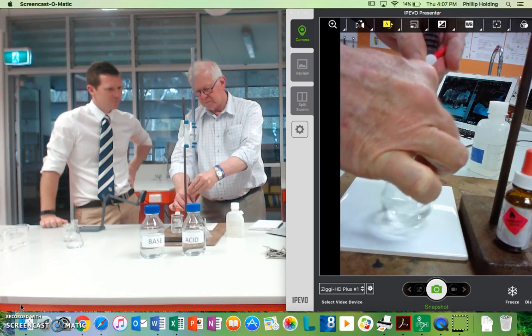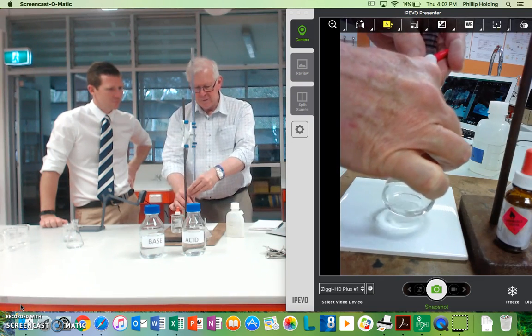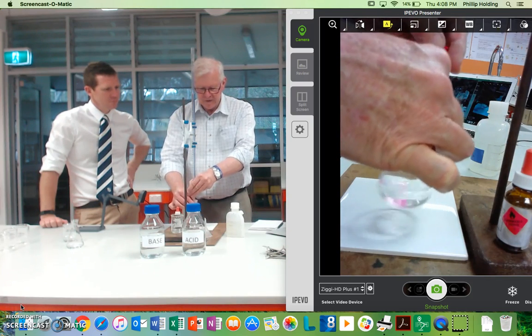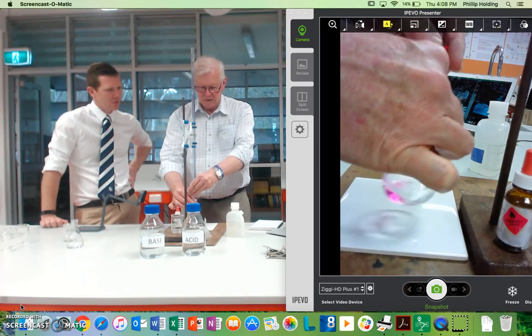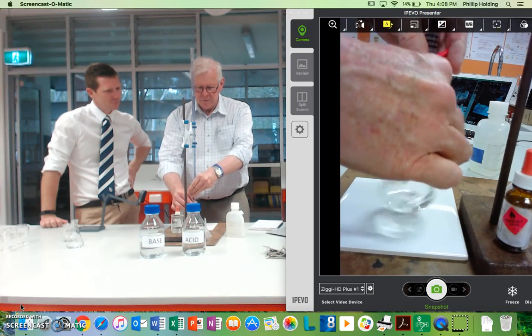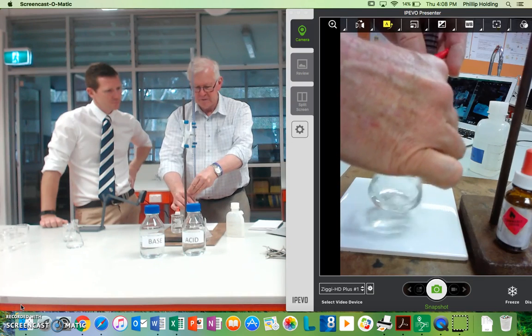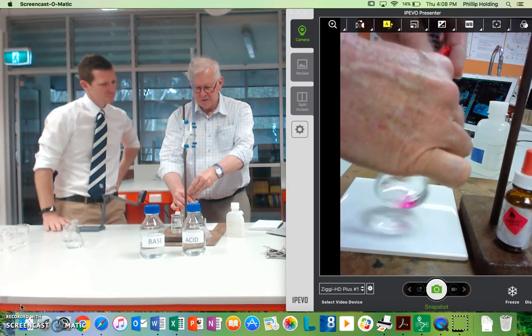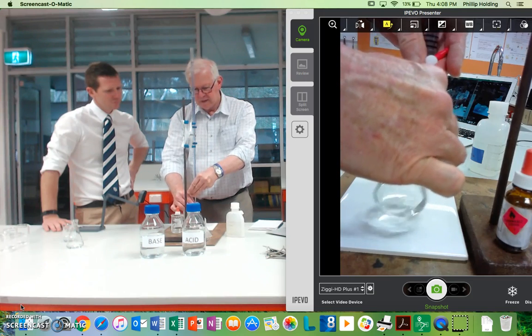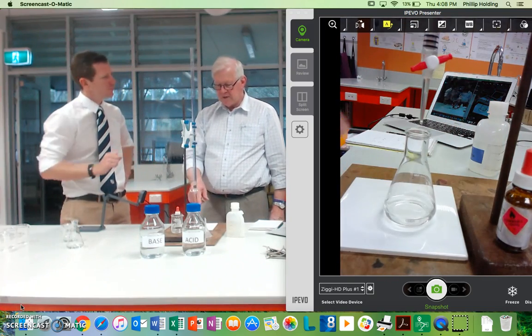So as we get closer and closer, we've got to be on our guard. The first titration is not too bad — we take that as a rough one, we want a target. I'm going to do two or three more accurately, so the first one doesn't have to be spot on. So that's taking a bit longer now. I'm swirling but the pink is staying around longer. I don't want to overshoot too much, but it doesn't matter because it's the first titration — it gives me a target. You've got to be able to control the tap to get it drop-wise.